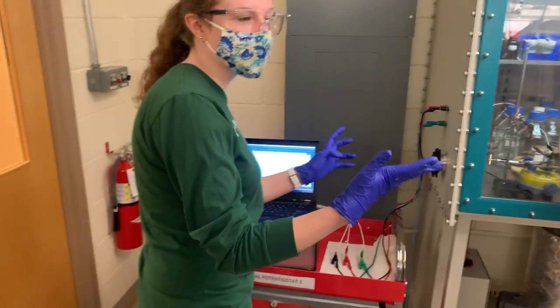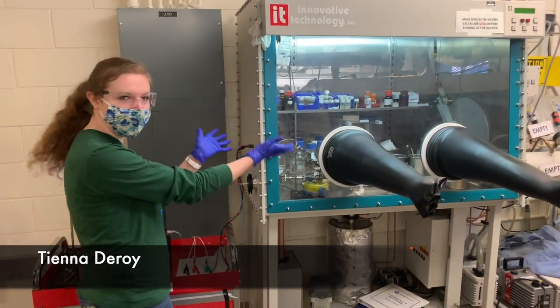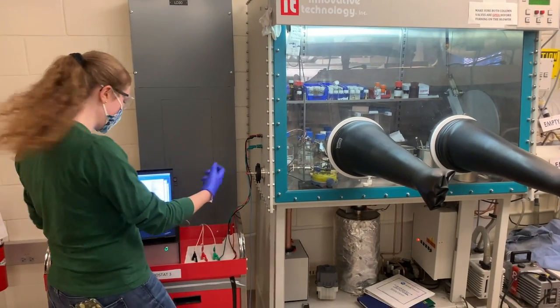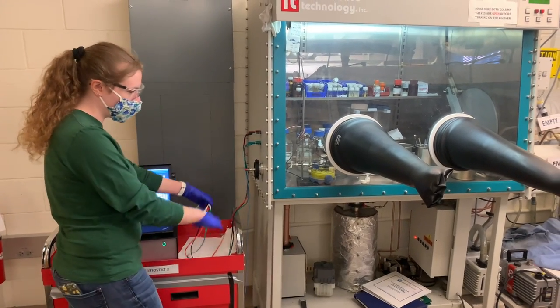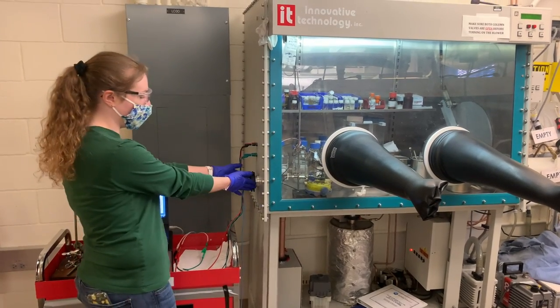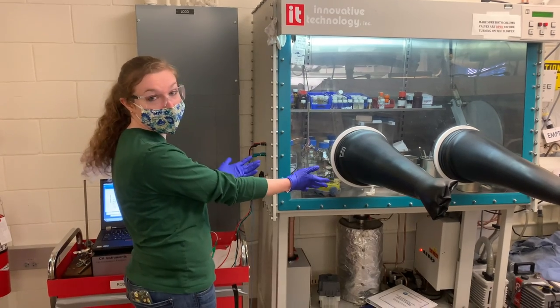When doing electrochemical experiments in the glovebox, obviously we can't bring our potentiostat into the glovebox, so we have external connections. We have our cord to a potentiostat connected to external cords, which then lets us do electrochemical experiments inside the glovebox. We also have a port for UV-vis, in case we need to do UV-vis spectroscopy in the glovebox as well.